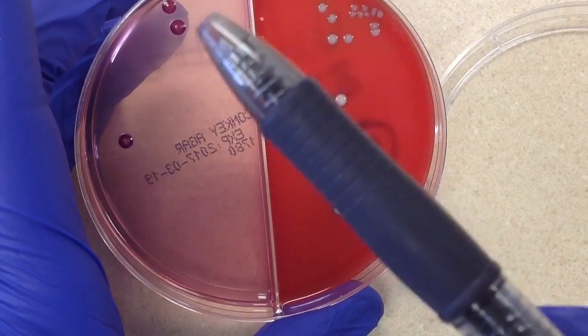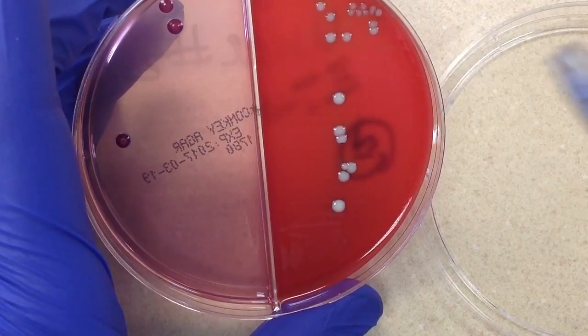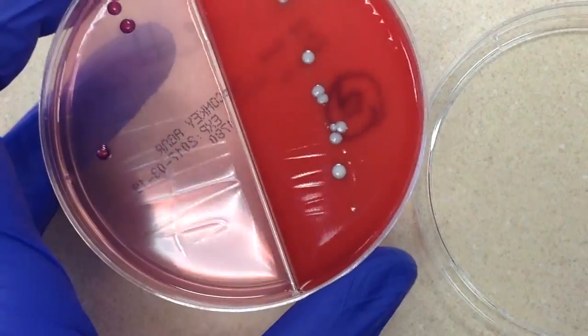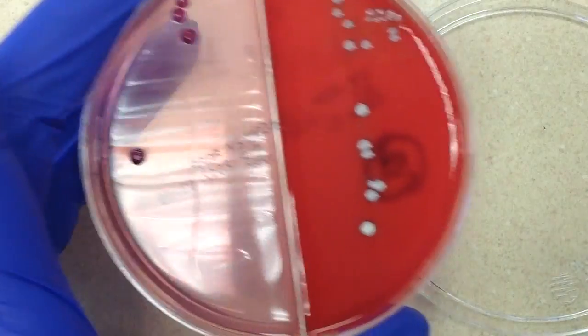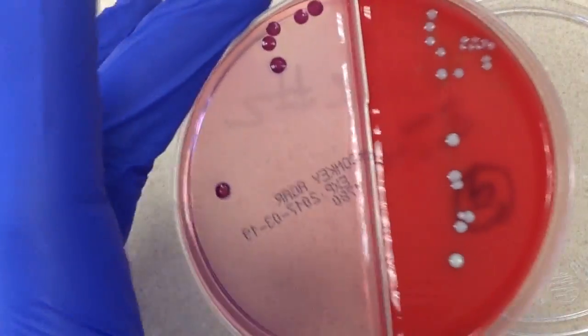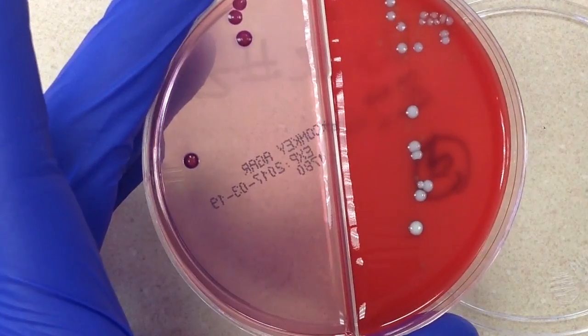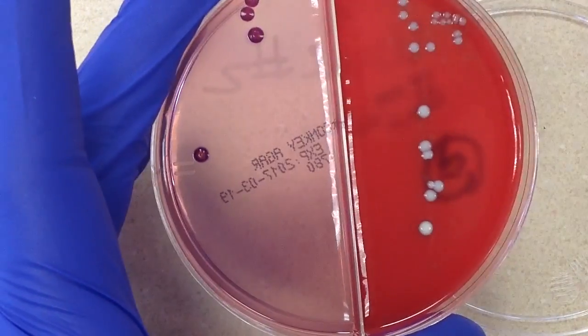We're probably looking at one colony type over here and then two to three over here. So for me, this is clearly a mixed specimen. The sample was either not collected properly or something. But once again, we have to take into consideration whether this is a catheterized specimen or just a clean catch.